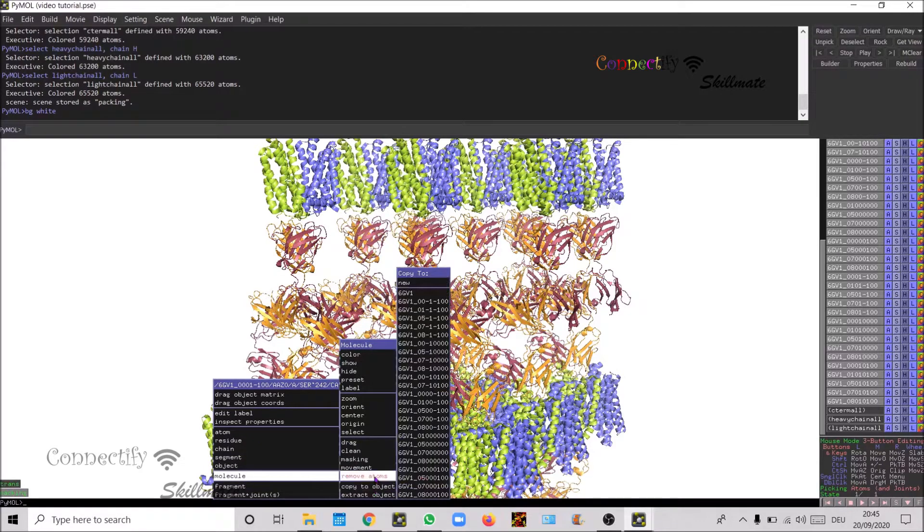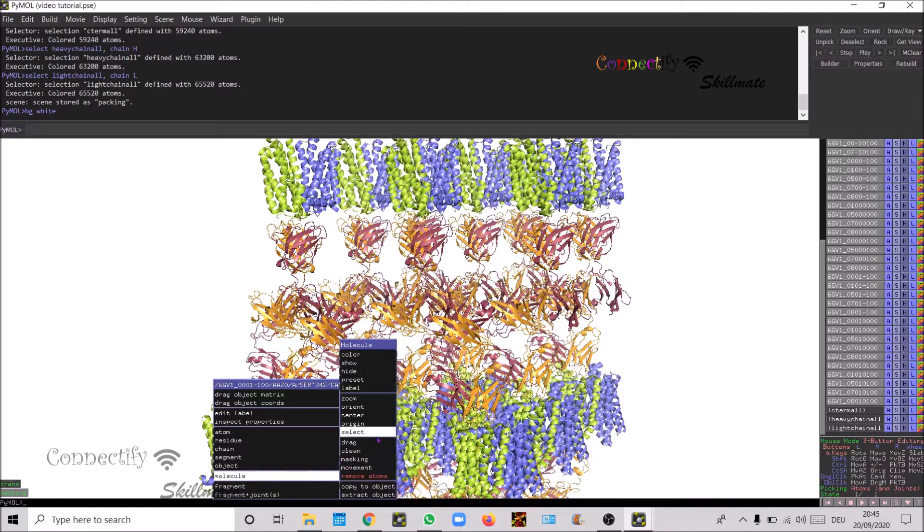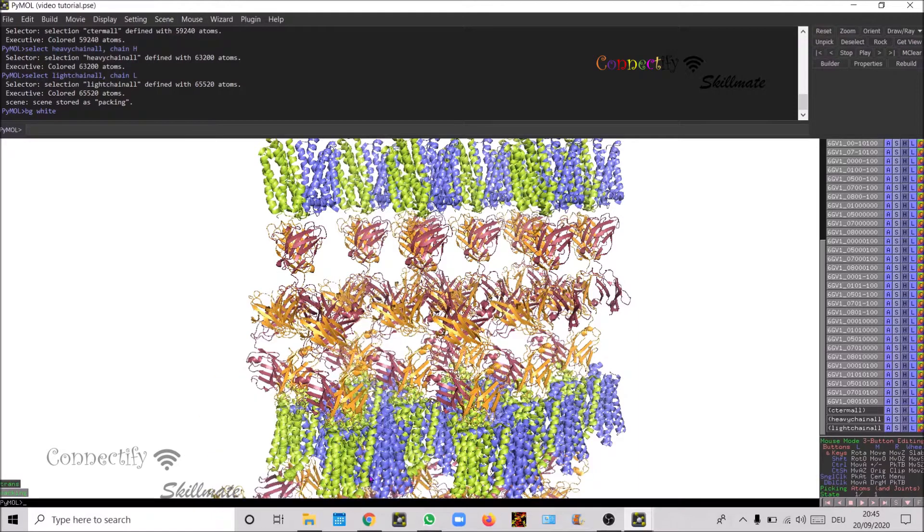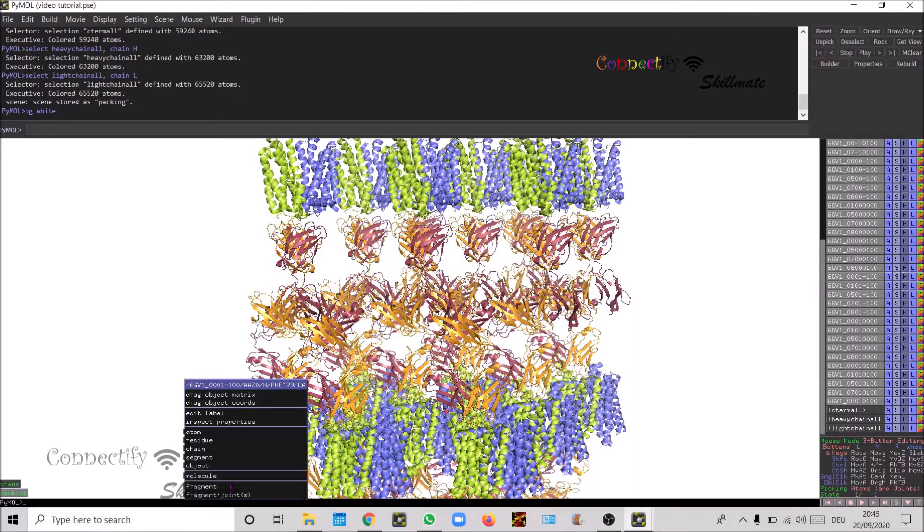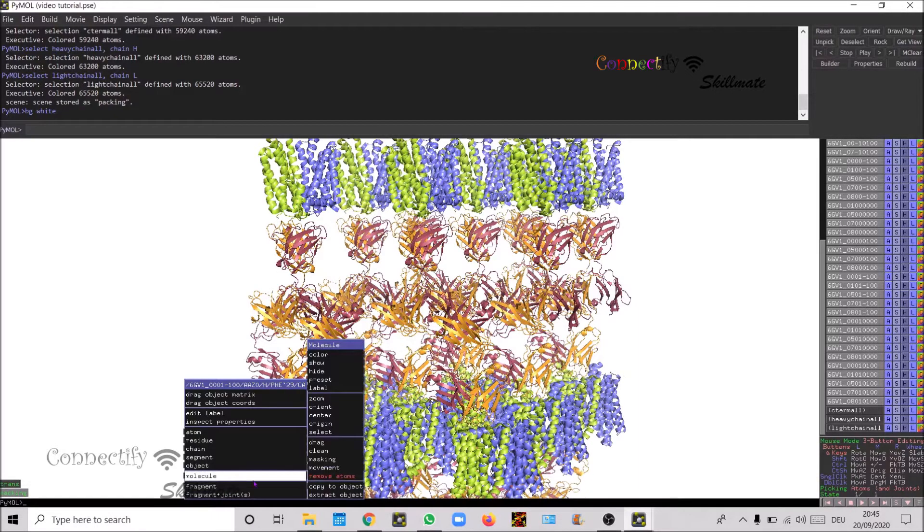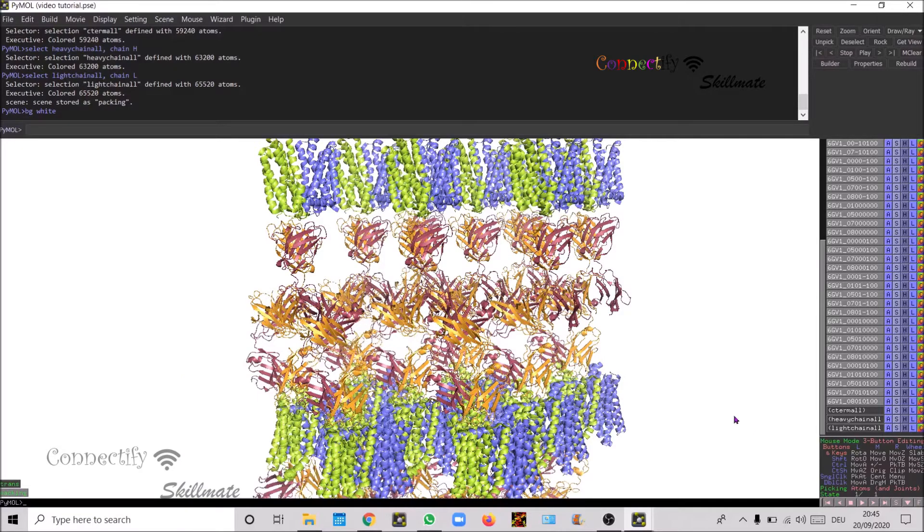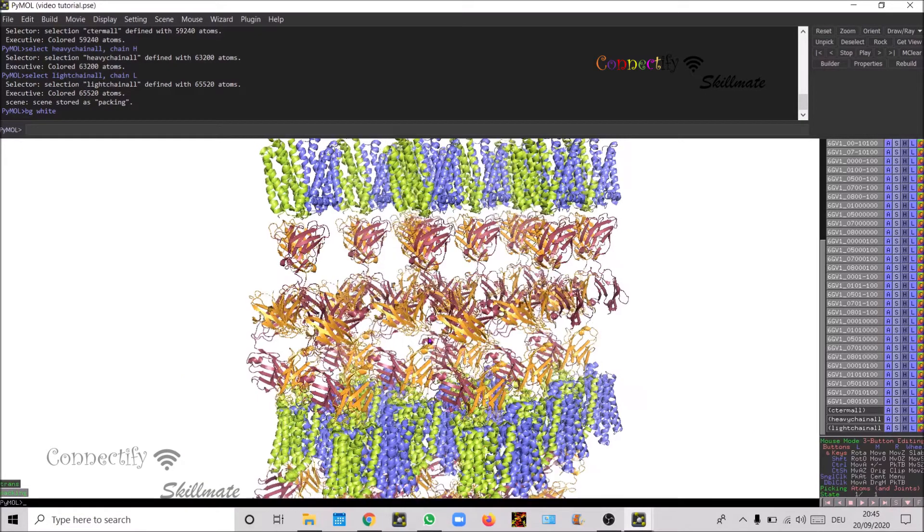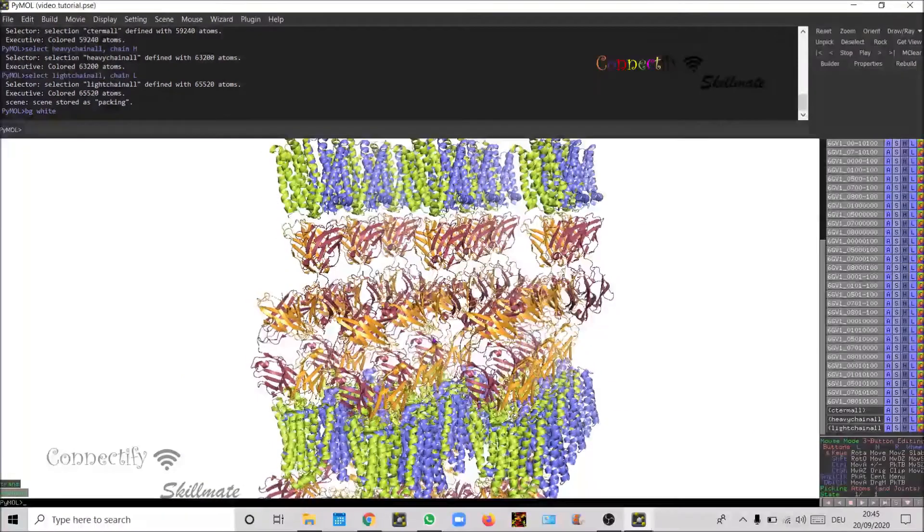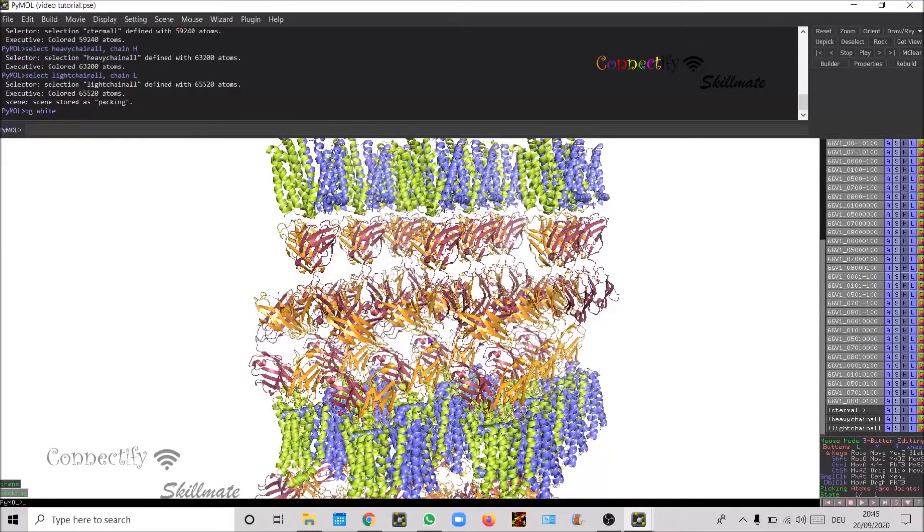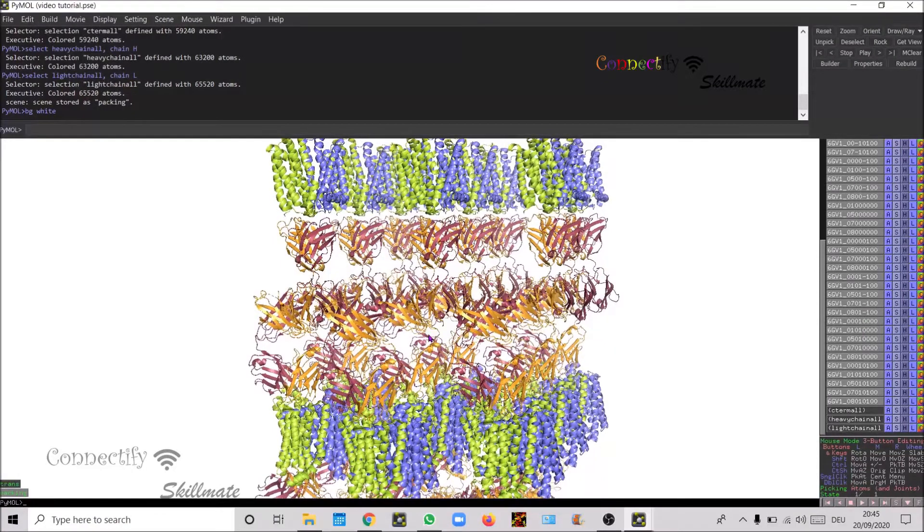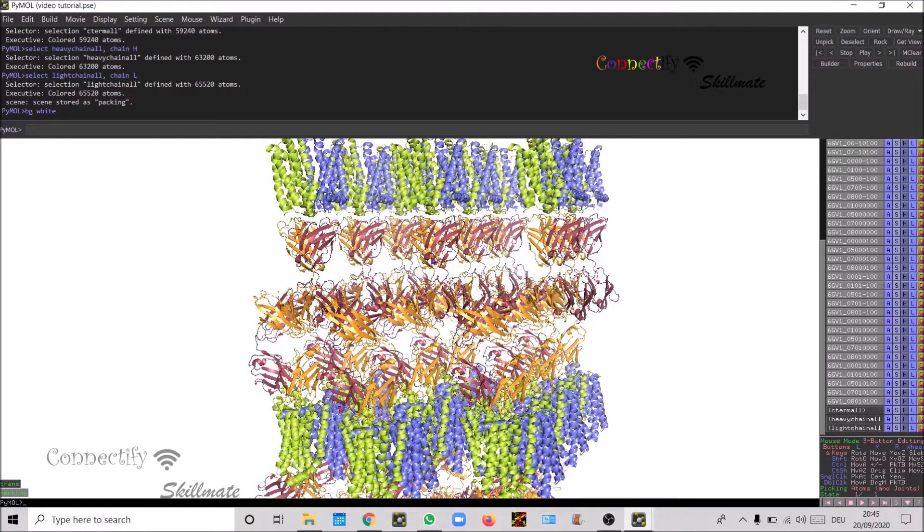I just removed atoms. So now you see it's a better representation of molecule. Now you can differentiate the N-term, C-term.